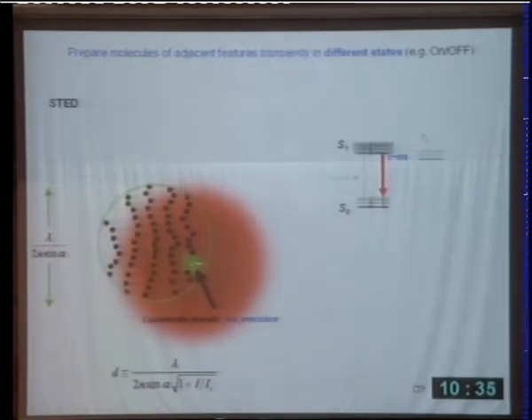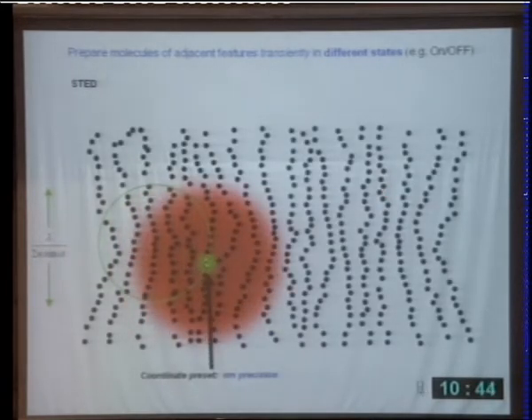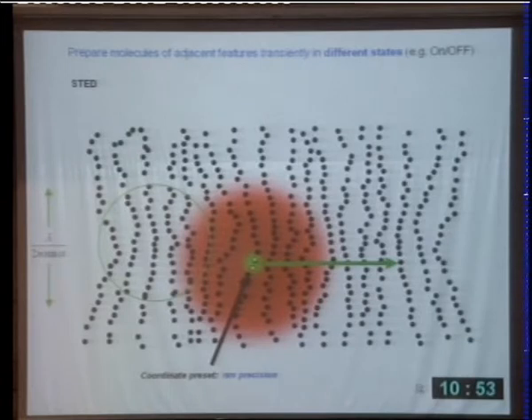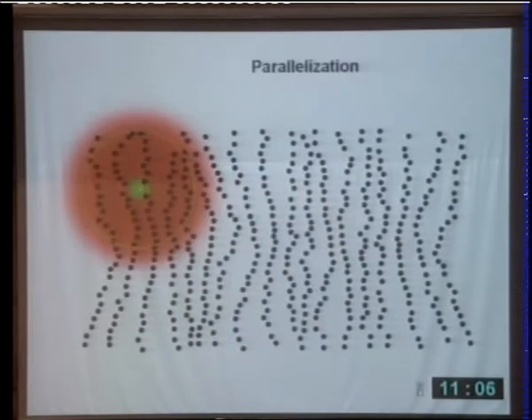That's predetermined. Okay, and so the signal here is proportional to the number of molecules that are found in here. So potentially many molecules are in that range. Typically, there are many molecules. So how do we get the rest? Well, it's very simple. We could move the beam like that, and then you can imagine we get an image that is, say, 10 by 10 micron or whatever, or even larger. But of course, the larger the area gets, the longer it will take to record the image, because if you move a beam like that, the recording time scales with the area. That's very obvious.